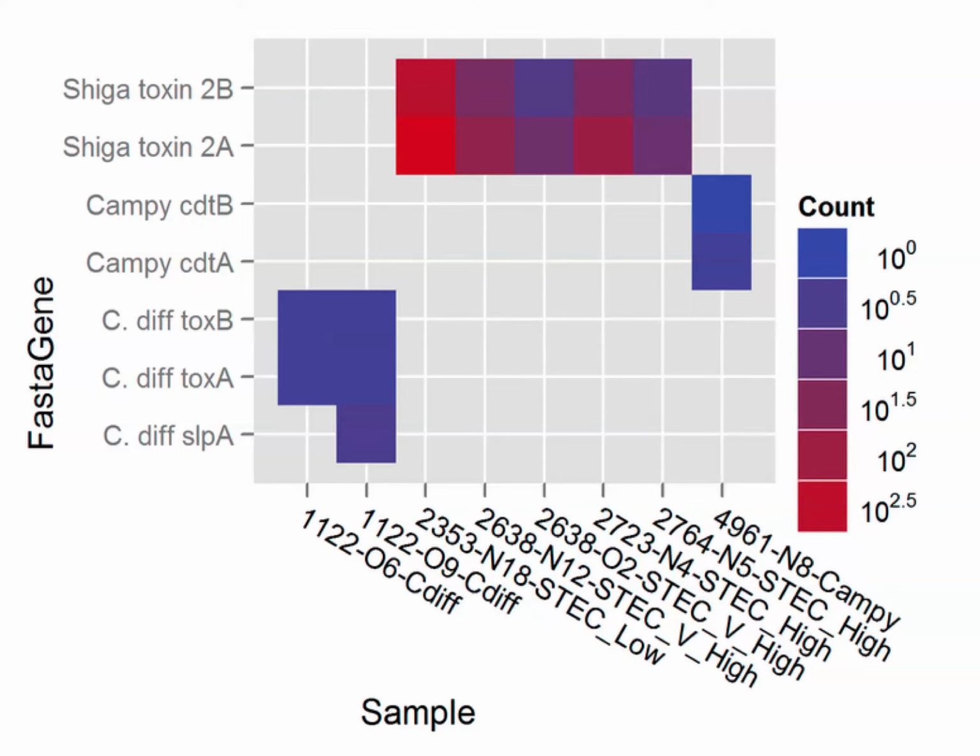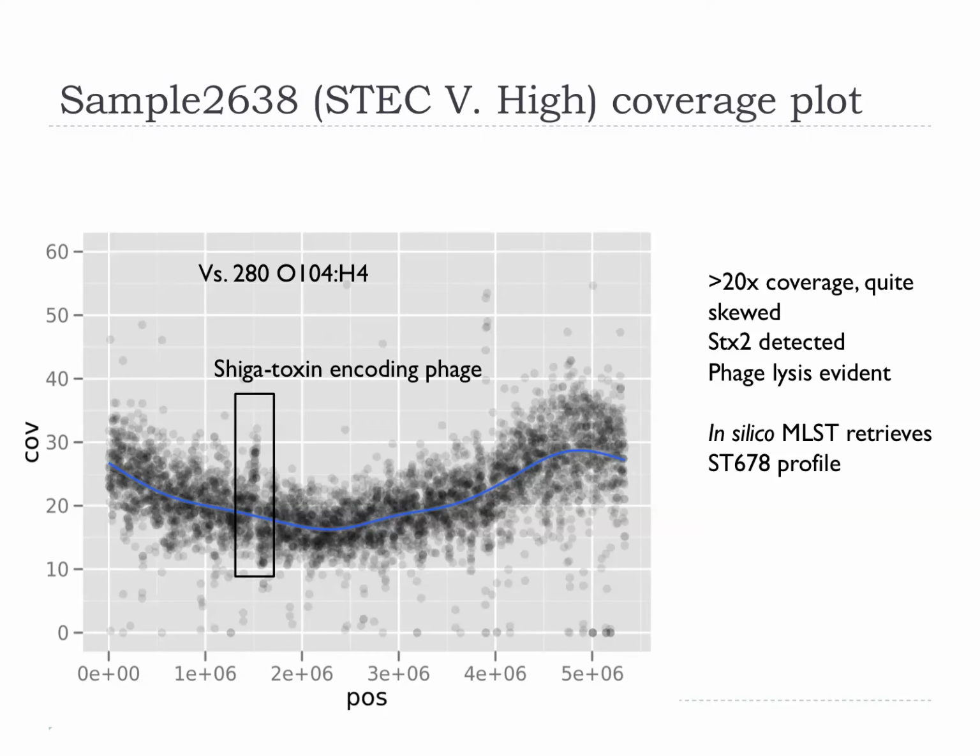Those of you who are awake will say, hang on, what about the Salmonella? The problem is he never did find any Salmonella reads in the so-called Salmonella sample. We don't know whether that's because we were given the wrong sample, or Salmonella was there in very low amounts, or quite what. This is all hot off the press, so we haven't got into the details of that yet.